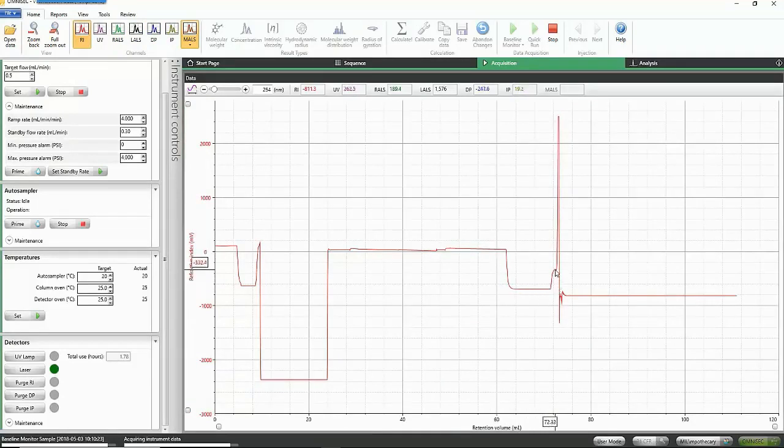I started the flow, it came back up, and then it immediately went off scale. And that was when the THF came through. And actually, it looks like it came back on scale here, but it really didn't. It's just so extremely off scale. You see this sometimes when there's massive differences in the RI detector. That's been stable ever since, but that's because it's really not doing anything. It needs to be purged and then probably zeroed after that, but that's fine.